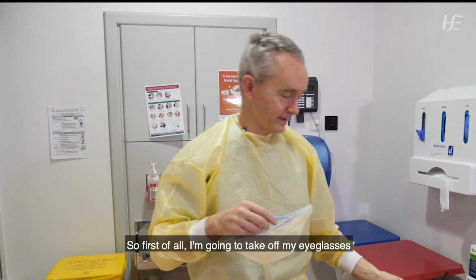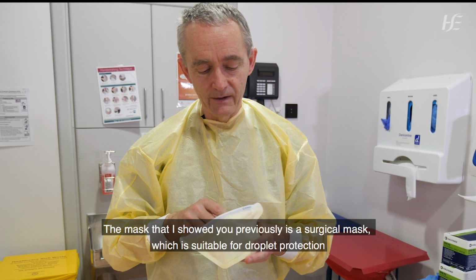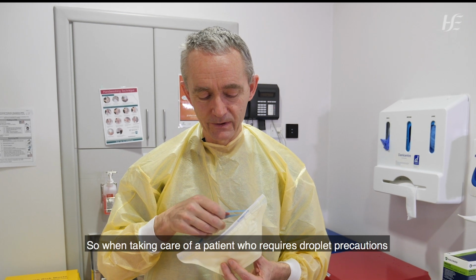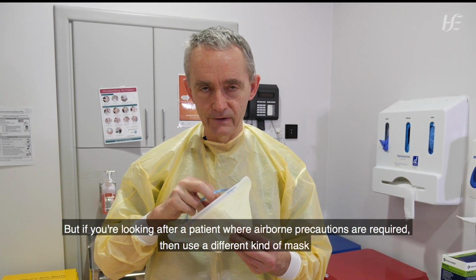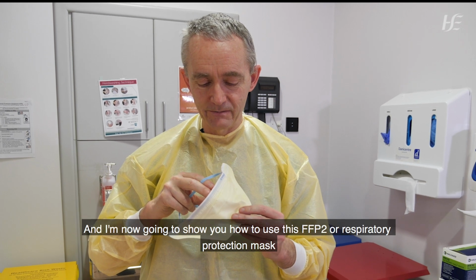So first of all, I'm going to take off my eyeglasses. The mask that I showed you previously is a surgical mask, which is suitable for droplet protection, so when taking care of a patient who requires droplet precautions. But if you're looking after a patient where airborne precautions are required, then use a different kind of mask. And I'm now going to show you how to use this FFP2 or respiratory protection mask.